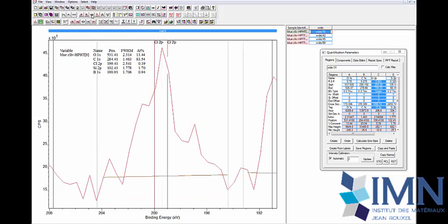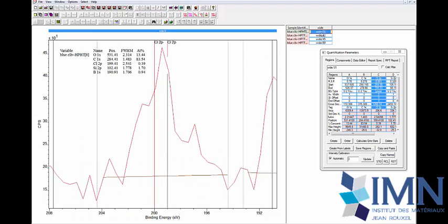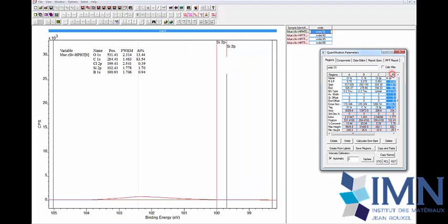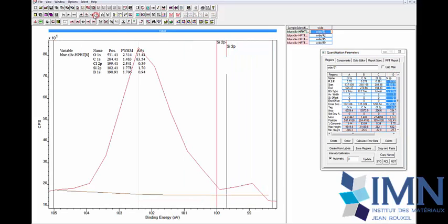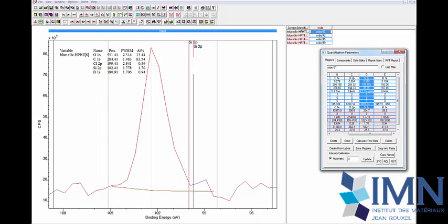Again, we verify for each measurement that the choices are good. As you can see, we have practically no chloride for the last sample and very low intensity for some others. So the idea of the statistical uncertainty is that it has to show us that the quantity that we measure is insignificant if we make a background when there is practically no intensity.